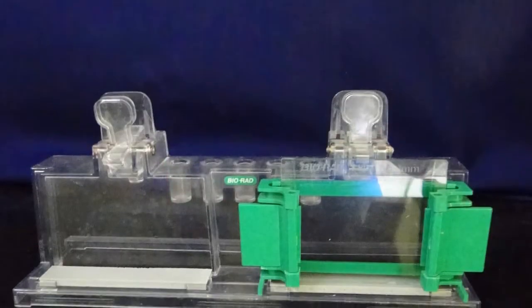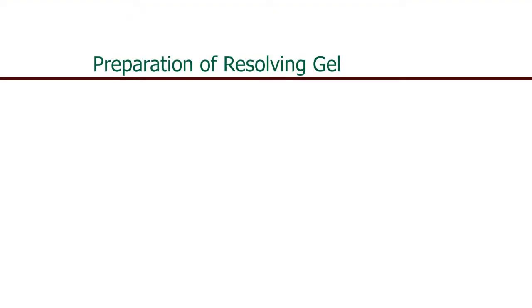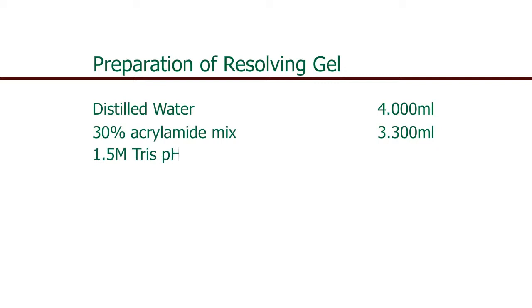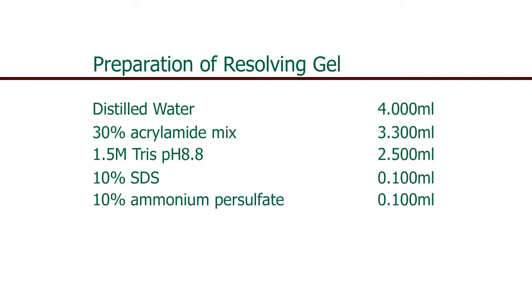Now cast the gels. For the preparation of resolving gel, we require distilled water of 4 ml, 30% of acrylamide mix of 3.3 ml, 1.5 molar tris of pH 8.8 of 2.5 ml, 10% SDS of 0.1 ml, 10% ammonium persulfate of 0.1 ml, TEMED of 0.004 ml.